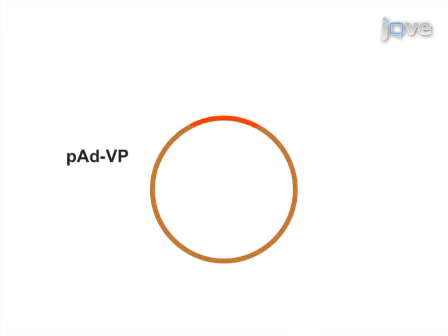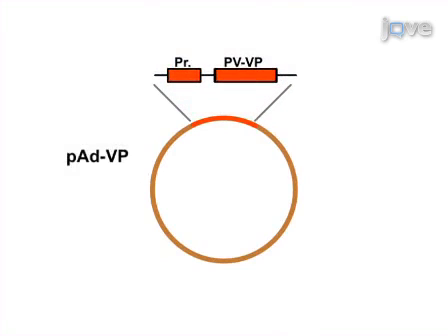The next step is to produce and purify this novel AdVP helper according to standard protocols.